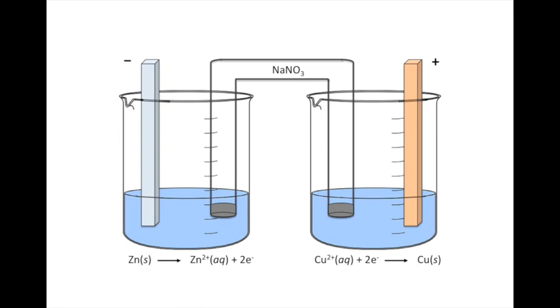So we'll show you how this works in just a second. But let's finish our galvanic cell. We need to connect the electrode over here, our anode, to the cathode with some wire. So we've just connected them with some wire that will conduct the electricity.